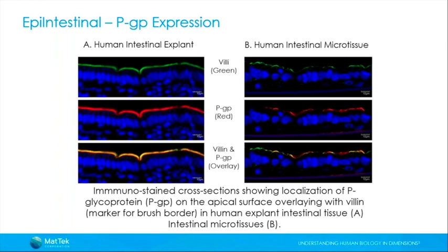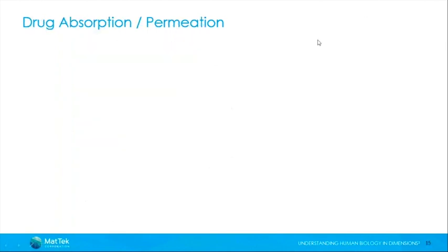The next question is, do we have the right polarization of this tissue model? To see if the transporters are located at the right location, we did a preliminary simple experiment over here.